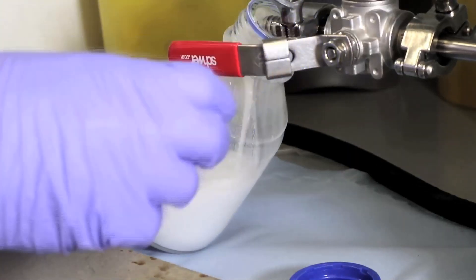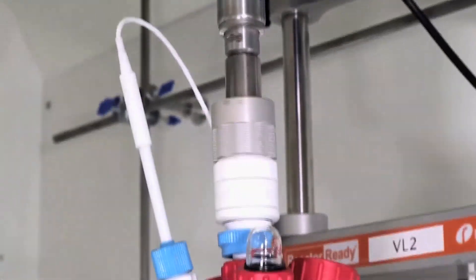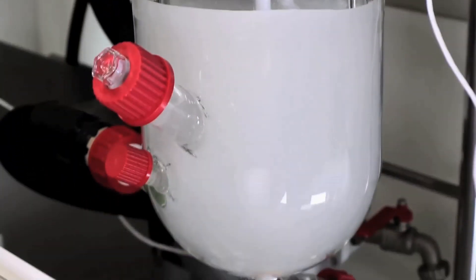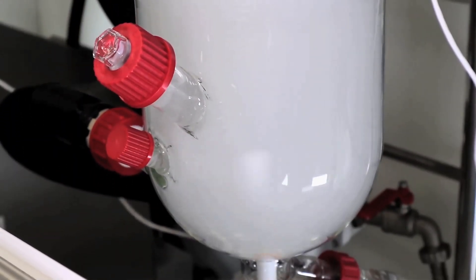The main advantage of wet milling compared to dry methods such as pin milling or jet milling is the technique is less aggressive and is the best technique for hydrates and highly static materials.